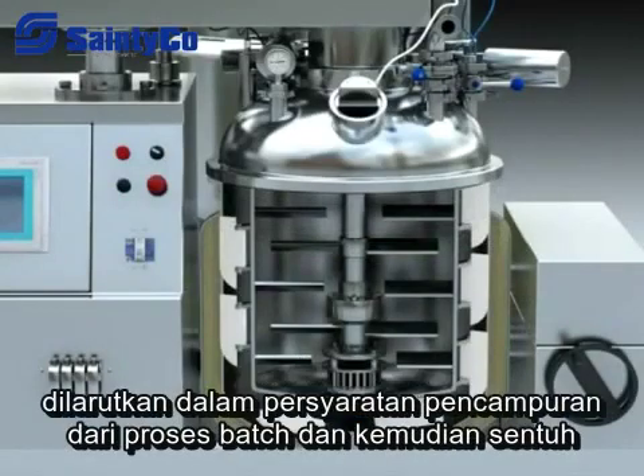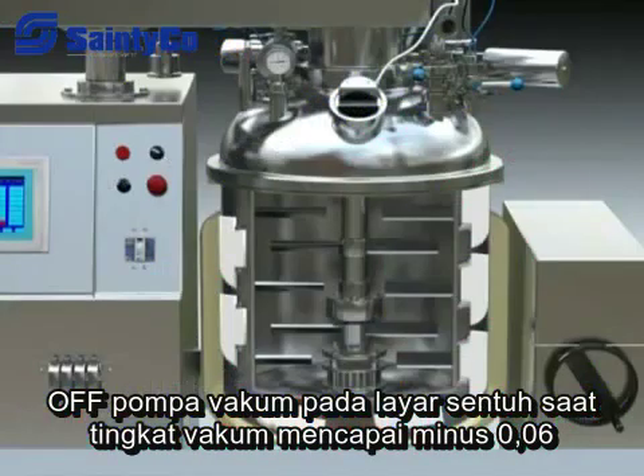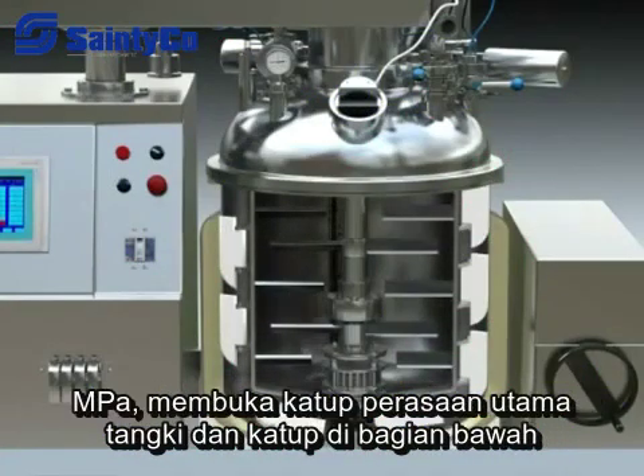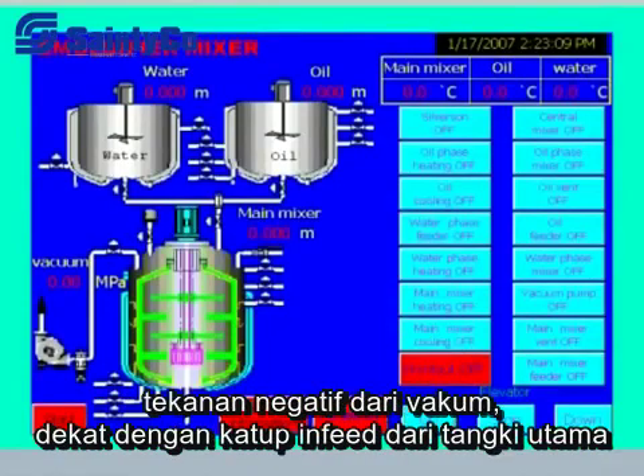For material feeding to the main tank, check if the dissolved material meets the requirements of the batch process, then touch the vacuum pump button on the touch screen. When the vacuum degree reaches minus 0.06 MPa, open the feeding valve of the main tank and the valve at the bottom of the oil or water tank, and the material will be drawn into the main tank under negative vacuum pressure.